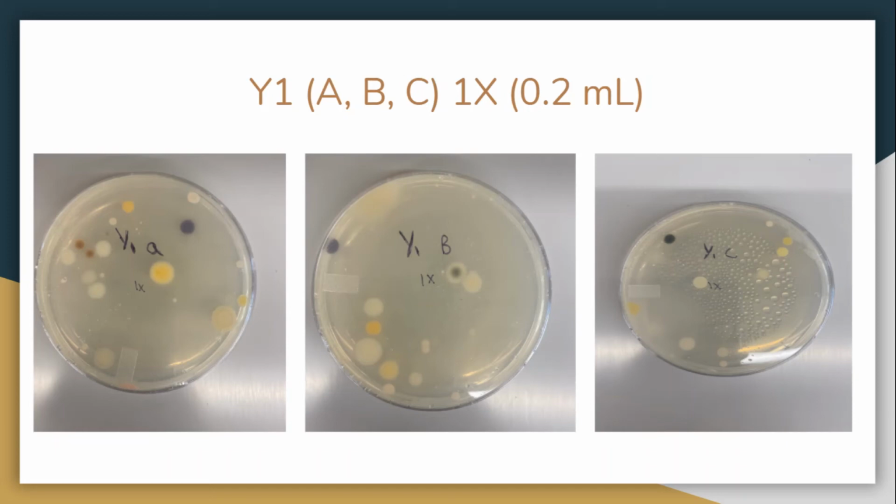The mean colony count for my plates is 111.67 and the standard deviation is 17.56. The small standard deviation suggests that there is little variability between samples.